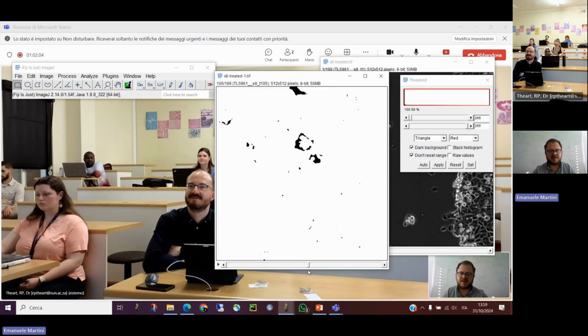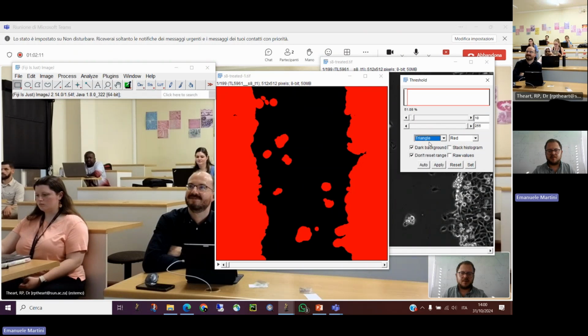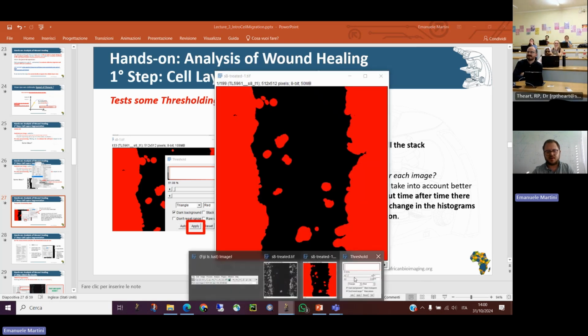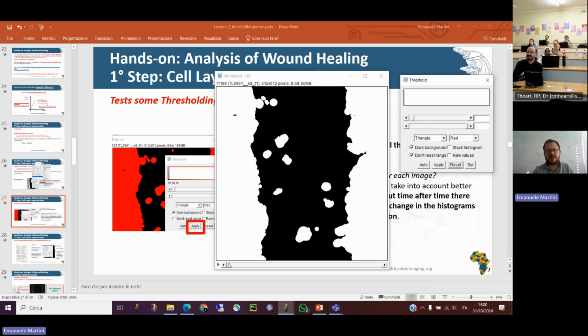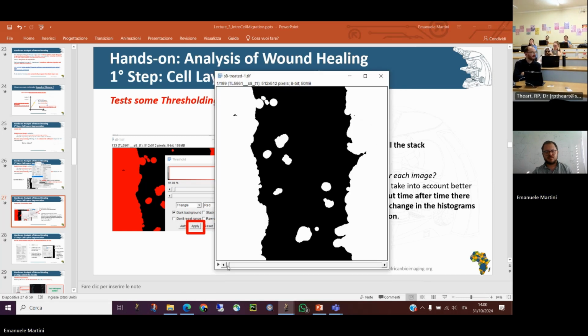Please check that it has done something like this. Okay, so be sure. Oh no, sorry, here I didn't put the threshold, but be sure to be at this point. So like this. Then you click OK. Okay, you have to put this kind of option, and then you click OK. You will obtain something like that. Now there is the threshold. Let me remove the threshold. You should obtain something like that. Okay. Let's see if everybody is at that point. Is it okay? Yeah, everybody's happy.